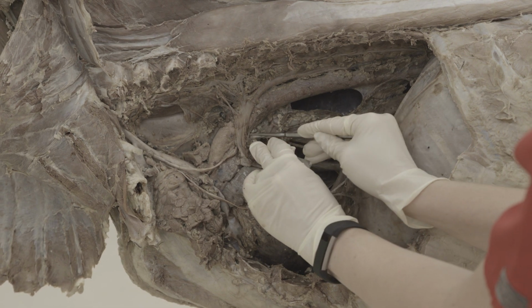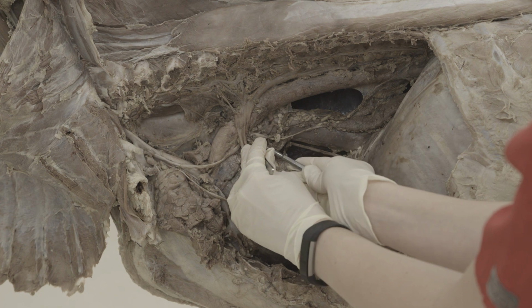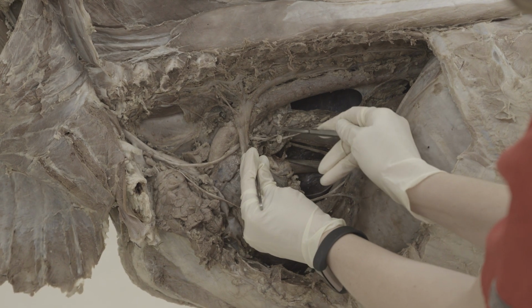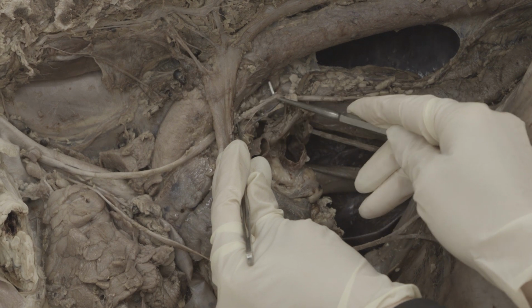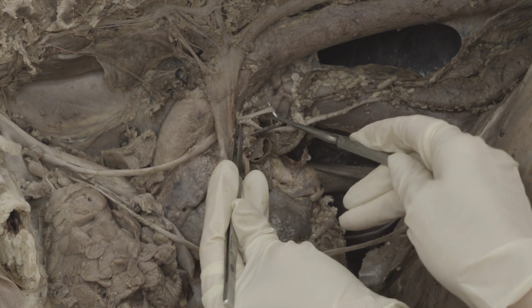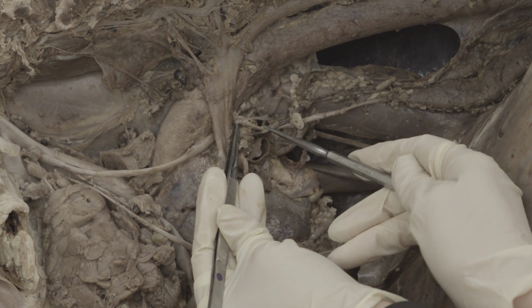But then if you trace the vagus nerve, I'm going to try and pull it out here so you can see the branches. There we go. The vagus nerve on the left side here is branching into a dorsal branch and a ventral branch. That will happen on the right side as well. You'll have a dorsal and ventral branch.